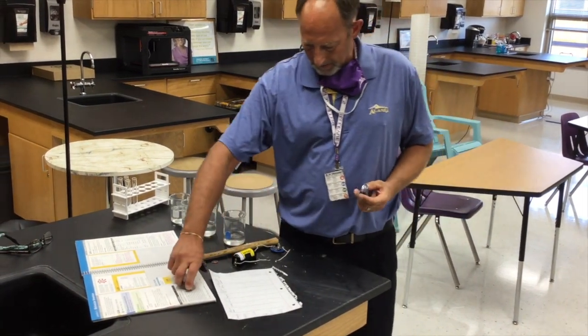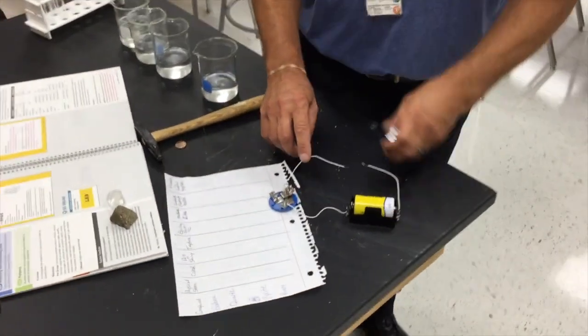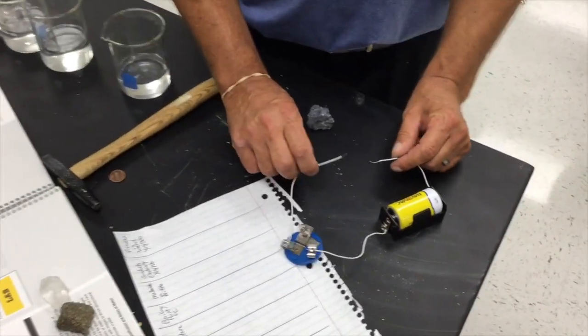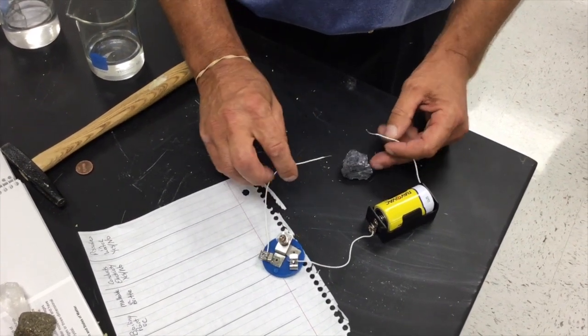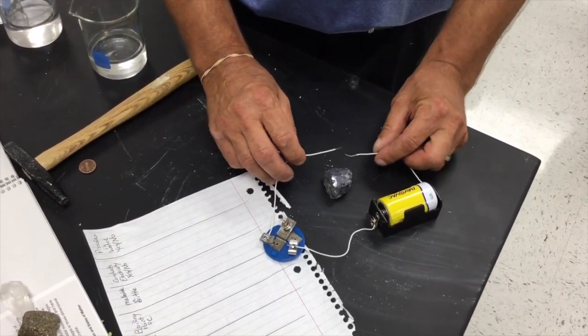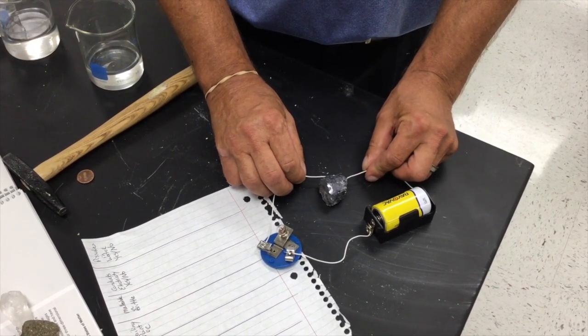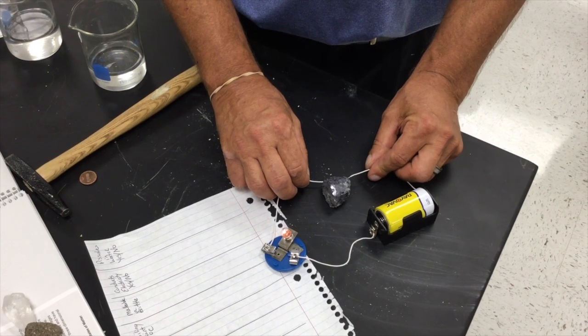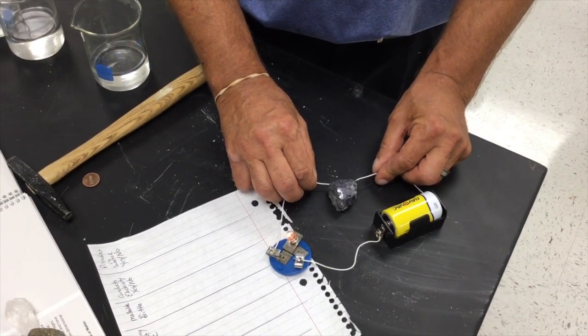Now, we want to test and see if this does conduct electricity or not. And as we looked at the other day, our conductivity tester, we have light, and then I will add galena, and we will see if this actually does conduct electricity. And we see some electricity being conducted. So the light is on, so that would be a yes.